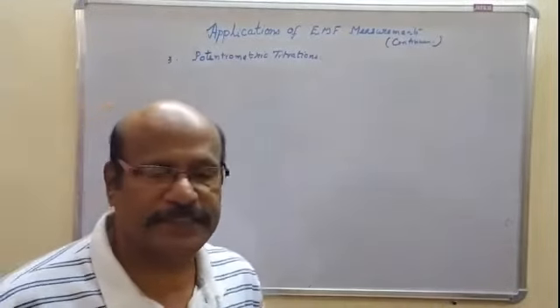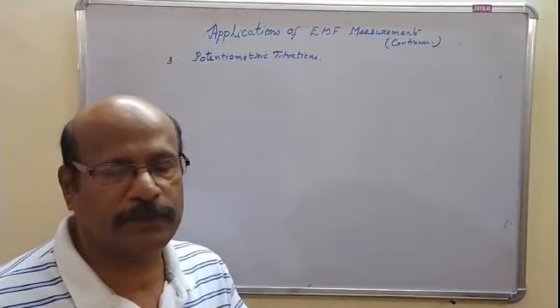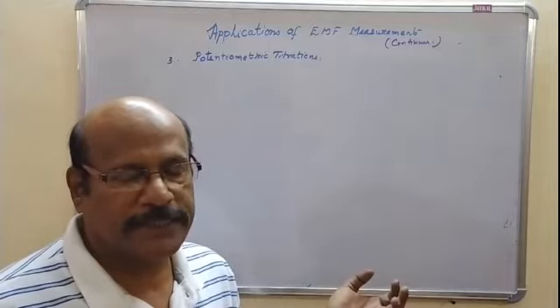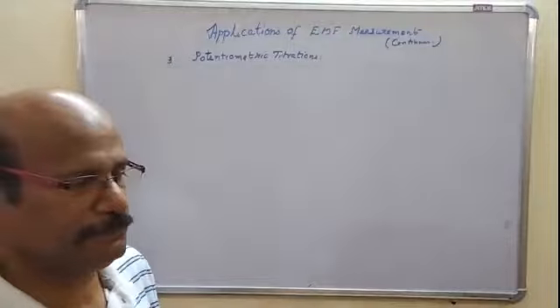The point at which there is a sudden change in the potential by the addition of a very small volume of the titrant is usually called the endpoint or breaking point of the potentiometric titration.